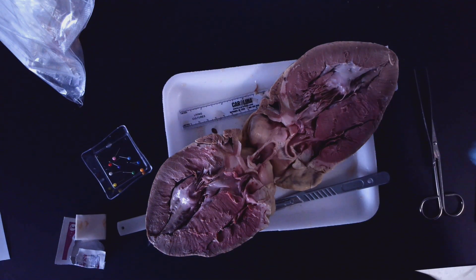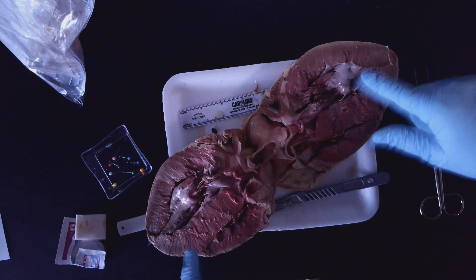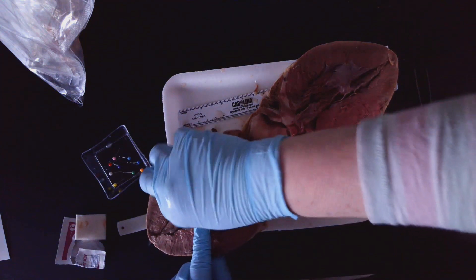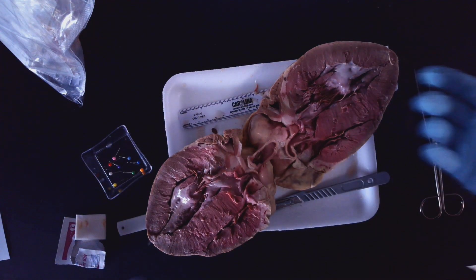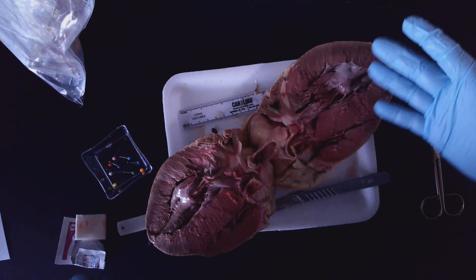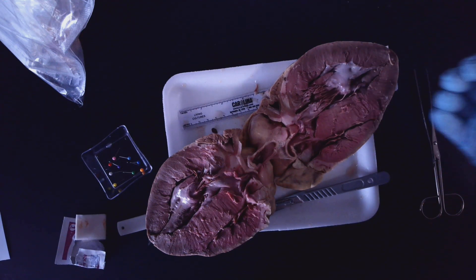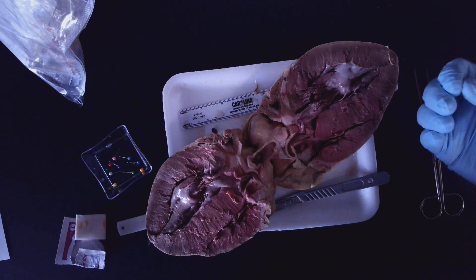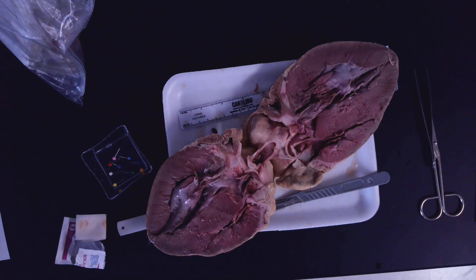Now we have the heart opened up. And we're going to be able to see a lot more now. So first, you can see — if you feel it inside here, it's kind of slippery, which is important because it's going to need to have the blood flow. So we have the heart cut open like this, and then we're going to have to do some looking and labeling. So let's move on to that.